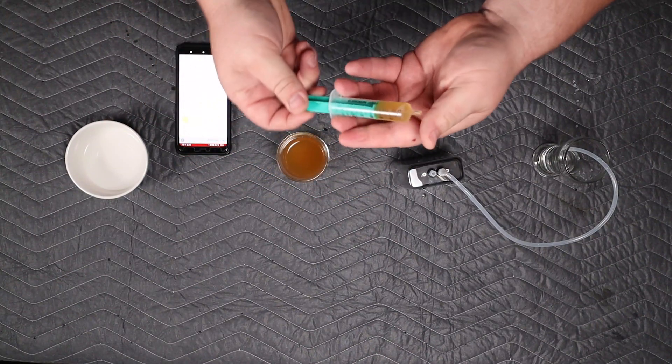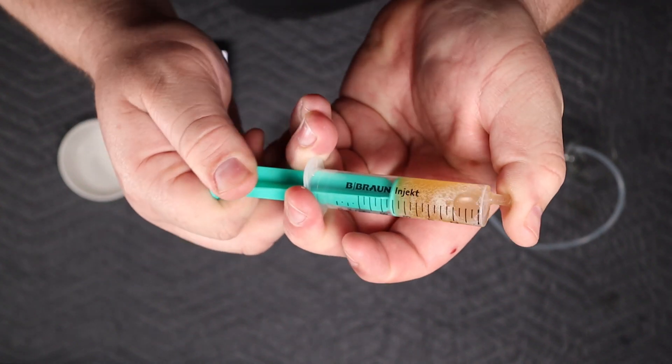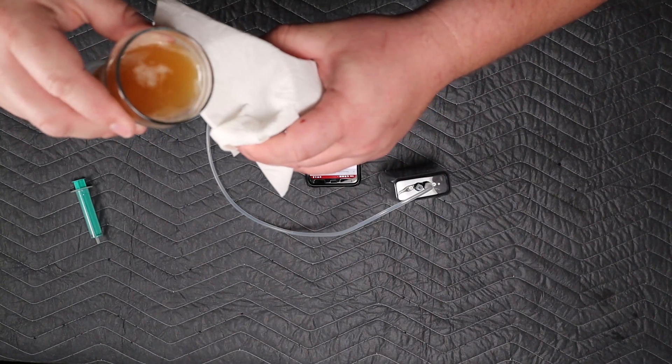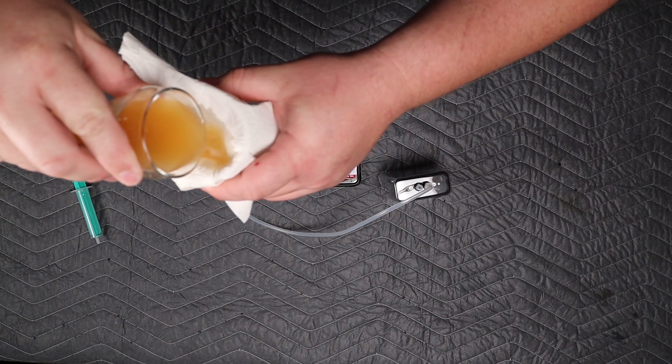So there's a couple ways to degas they list. You could put it in a sonic cleaner for 10 hours or something — I don't have that kind of time. You can simply draw up like half a syringe, say four or five mils, cover one end and pull the plunger out, and you're going to see all that CO2 just escape from the sample. You can do this five, six, seven, eight times, but it's kind of cumbersome and a pain in my opinion. I prefer just to pour the sample through a coffee filter, paper towel, whatever — filter it. I find that degasses it, and it's also one of the methods that Anton Parr in their video has suggested. Sometimes after I've sucked it into the syringe, I'll degas it one last time that way just to get any bubbles I can out.